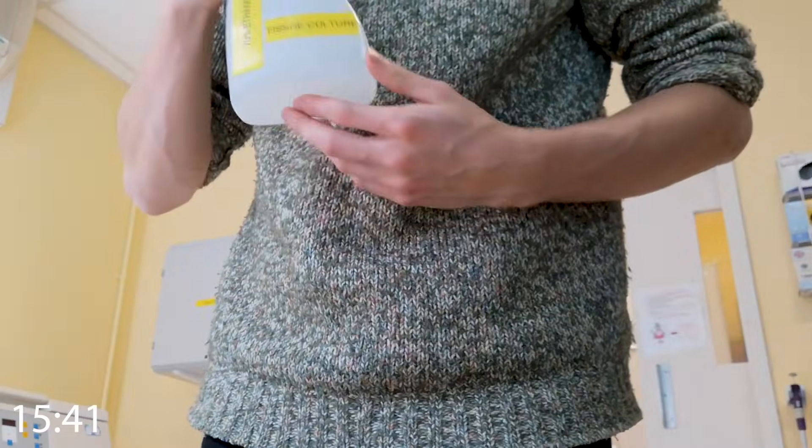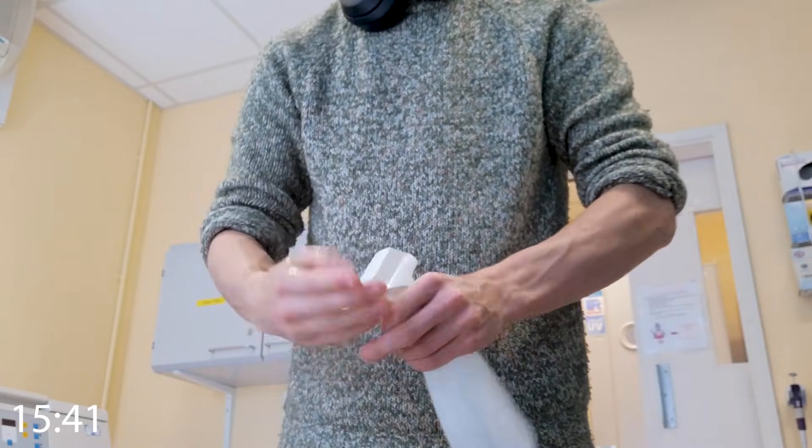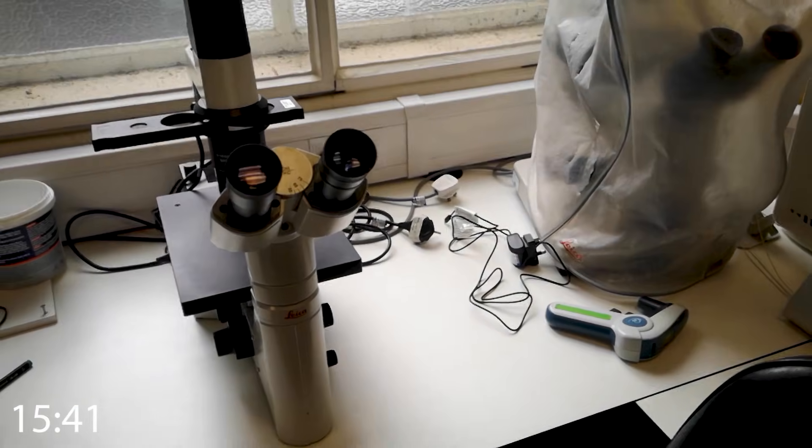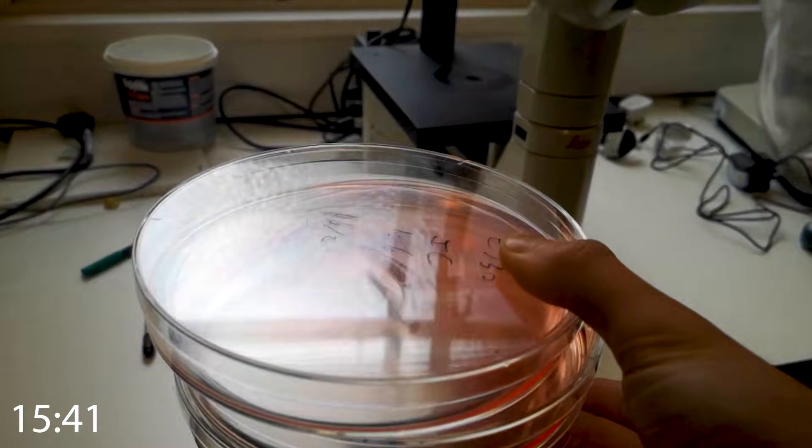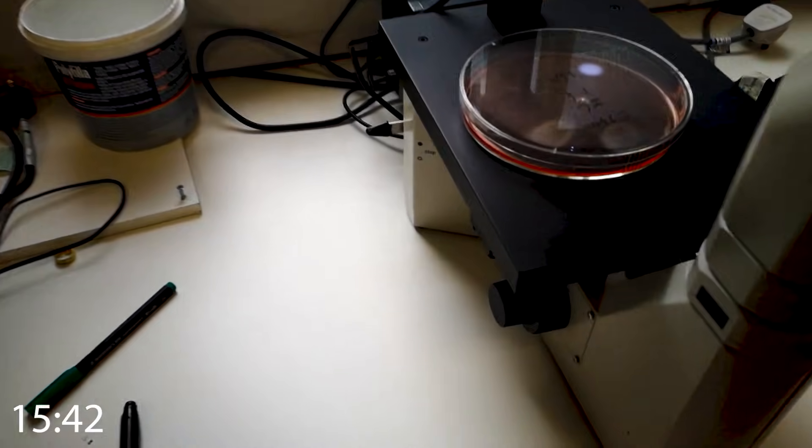Now going to the basement floor to grow some real-life human cells. I grow human cancer cells in petri dishes and I need to make sure that I don't contaminate them, so I inebriate my hands. I then unleash this cute microscope and then take out my cancer cells from the incubator and have a sneaky peek under the microscope. The cells look good, nice and alive without any contamination, so I still have my will to live.